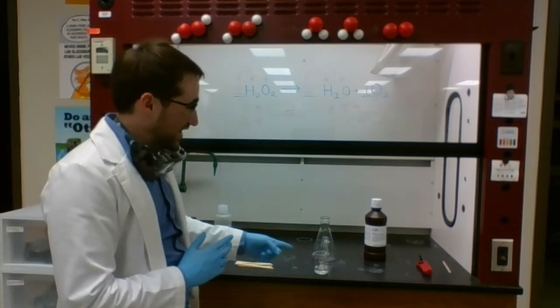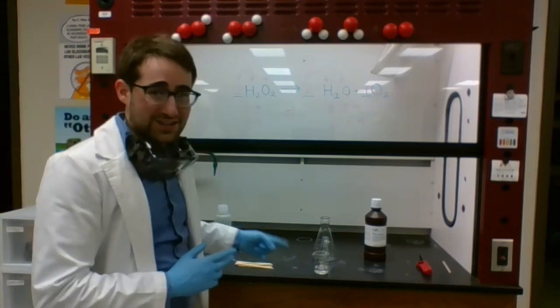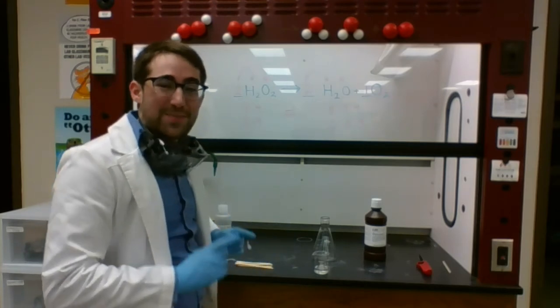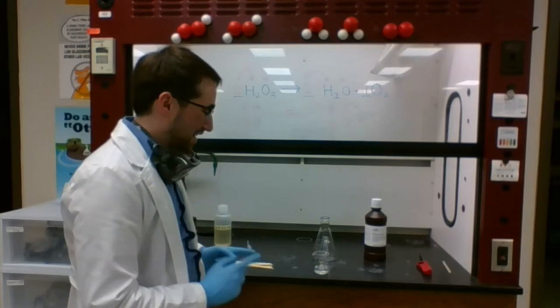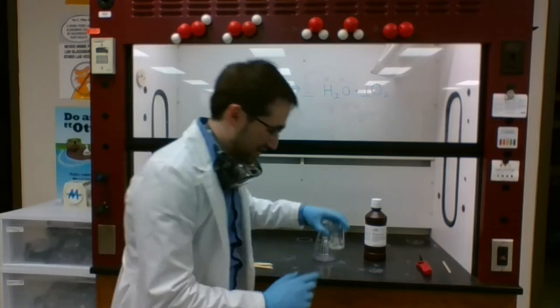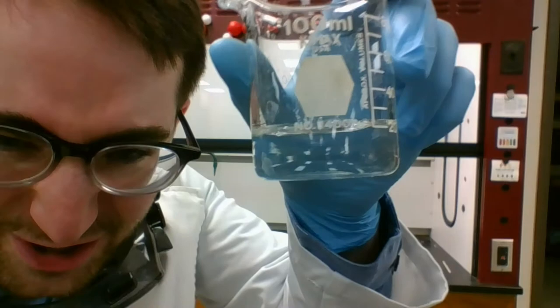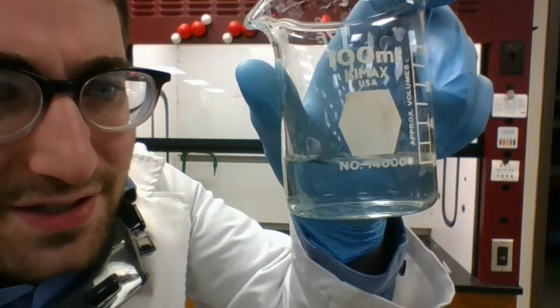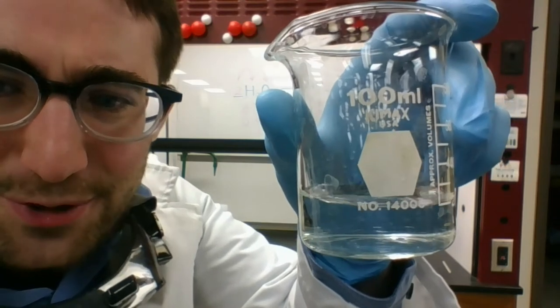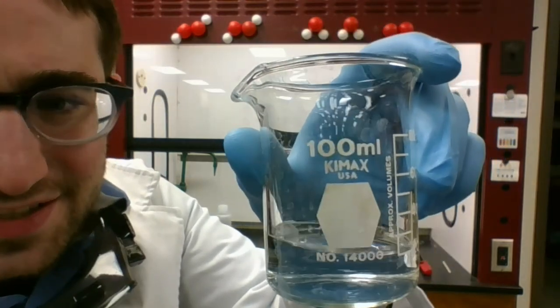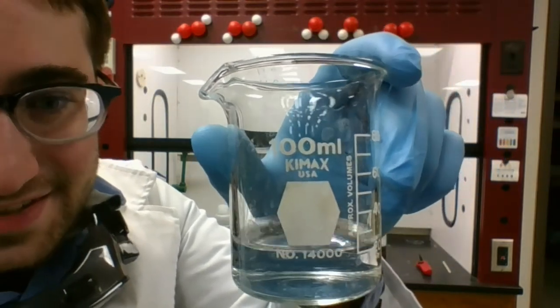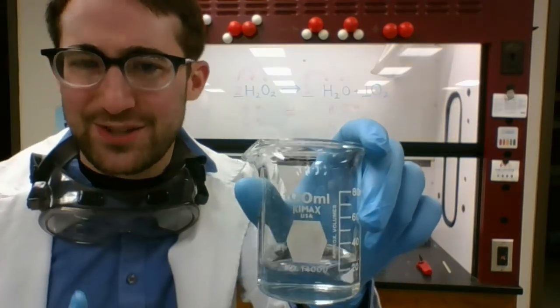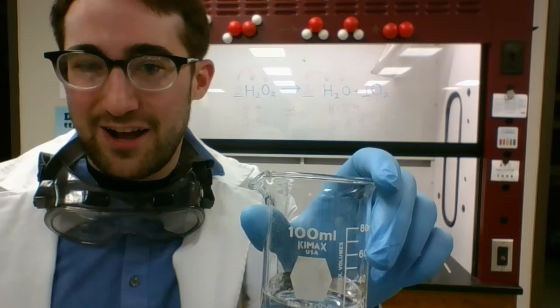Now, if this is turning into water and oxygen gas, I should be able to see bubbles, but I can't. This reaction happens so slowly that it's not even noticeable. I can get real close up to this and look at the hydrogen peroxide real close, and nothing. So, I need to step this up a little bit. I don't want to wait forever to see or test and figure out if this is actually decomposing or not. I want to see it happen in front of my eyes. So, we're going to change a couple of things about how we do this.